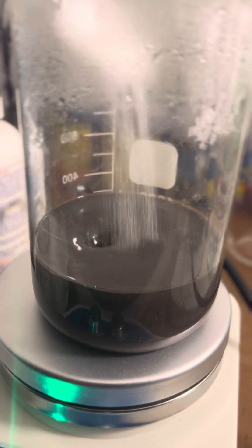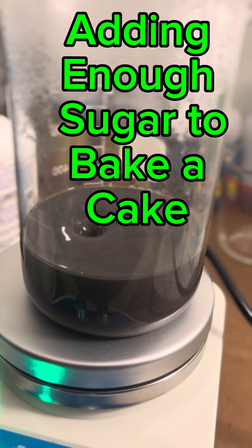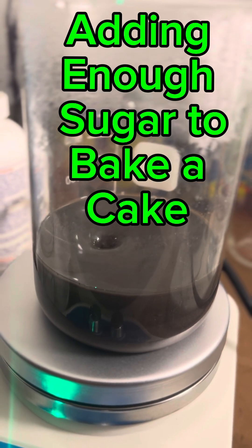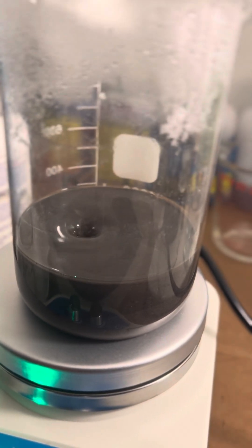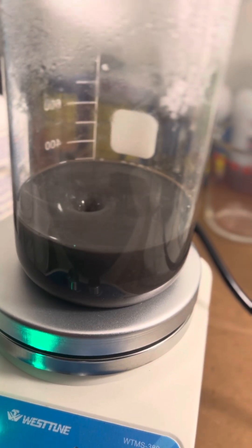Starting to add the sugar now. We've got to watch it because it's going to boil over.